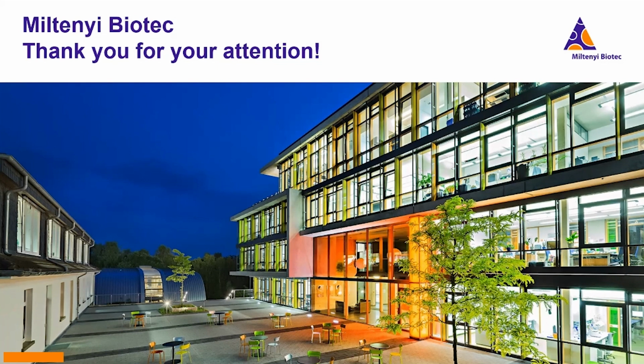The first question is, do you dissociate the FFPE tissue to obtain cells or nuclei? I elucidated that partially already within the talk. In our discussions with 10x, they were saying that the larger proportion of the results we obtain are coming from nuclei, and we see that as well in our experiments. For us, it might be even stronger. If you dissociate your samples using our kit, most of the reads will come from nuclei and not from single cells.